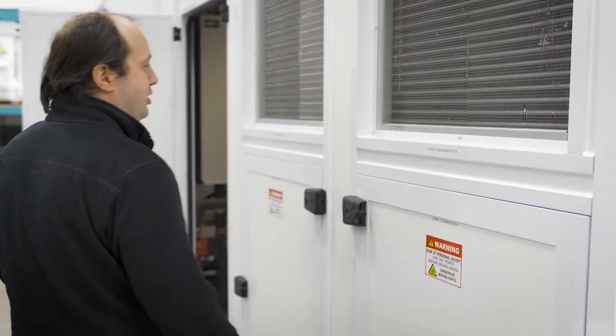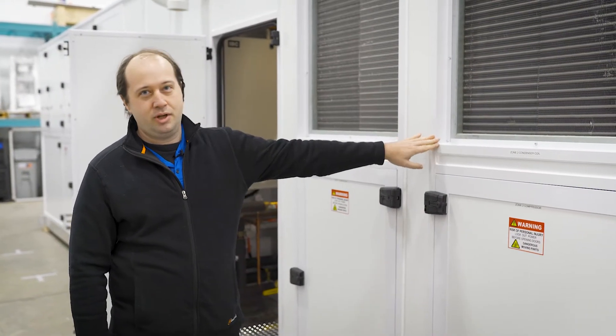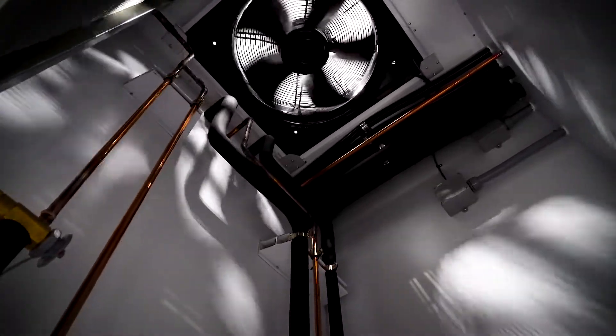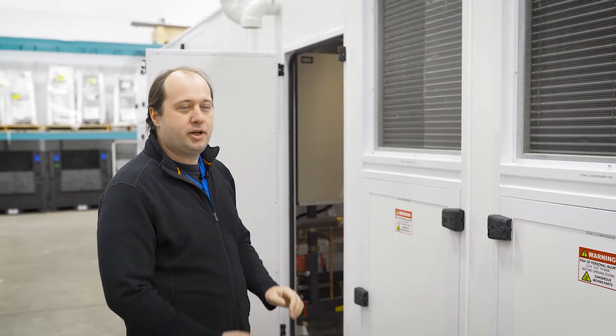On this end of the unit is the packaged condensing unit for the three zones that we're supplying air into. This side is zones one and two. The other side is a coil for zone three.